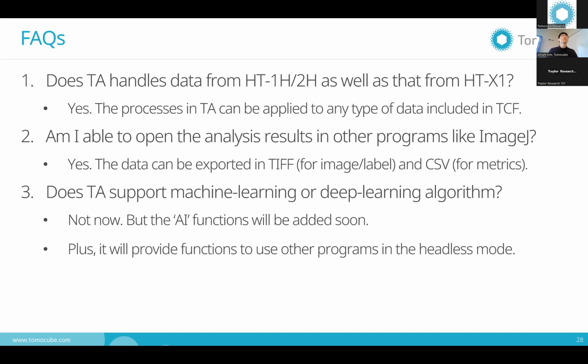At the moment, what we find is that it's very difficult to segment cells because it's very confluent. It's a compact structure, tissue. But we found that we could extract the morphological aspects of the tissues. Based on that feature, we can separate some of the specifics of tissues. I don't mean it can segment those cells individually, but we can extract the characteristics of the tissue with a certain spatial resolution. So I think we can do something in tissue analysis as well.